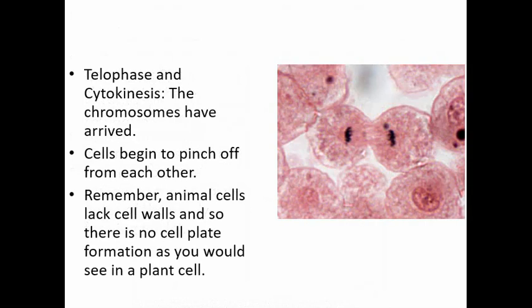Finally you may see some cells in telophase and cytokinesis. Here the chromosomes have arrived at their destination and the cells begin to pinch off from each other. Remember in animal cells like this whitefish their cells lack cell walls and so there is no cell plate formation as you would see in a plant cell like the onion roots.